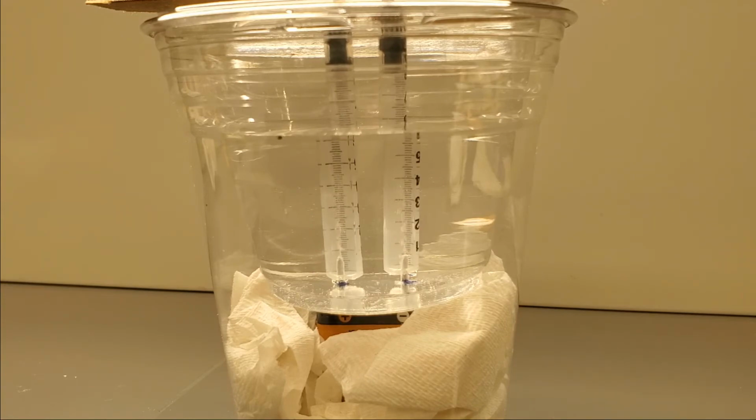The experiment has now begun. Keep an eye on the gas levels inside of the syringes so that you can monitor the progress of the reaction.